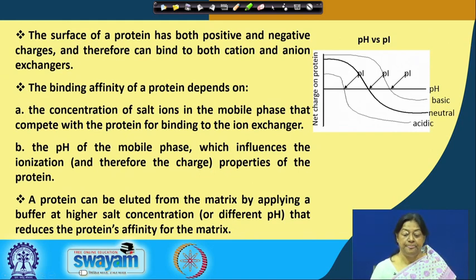chloride concentration. Now, if we look at our protein of interest, the pH of any ion exchange chromatography method is extremely important. We know that we have a specific isoelectric point of the protein. Now, if we choose a pH that is less than the isoelectric point, the protein is going to be positively charged. If we have a pH that is greater than the isoelectric point of the protein, we have a negatively charged protein.